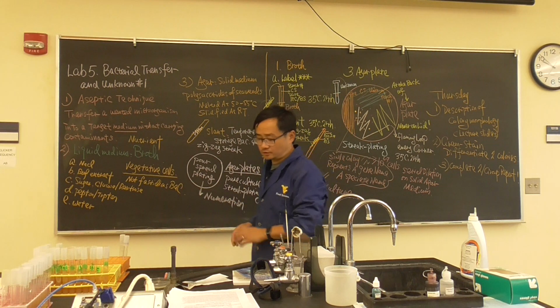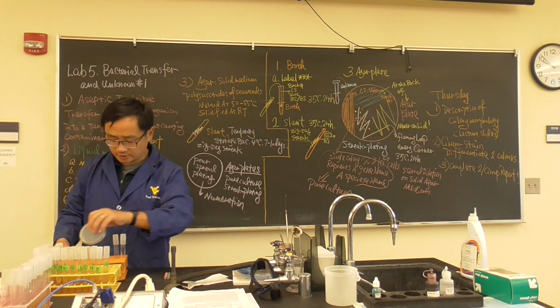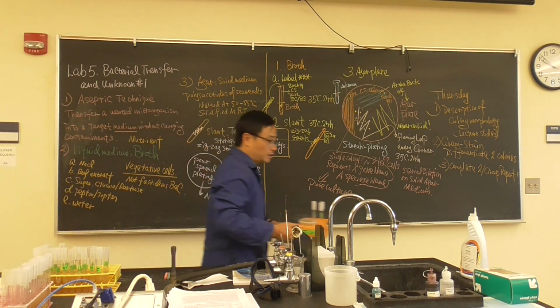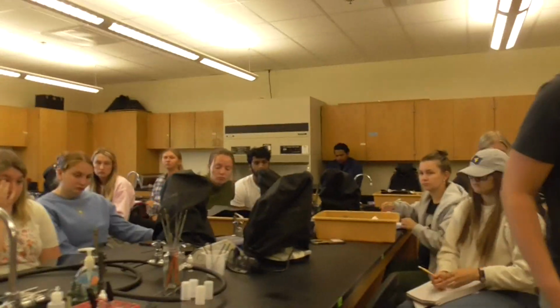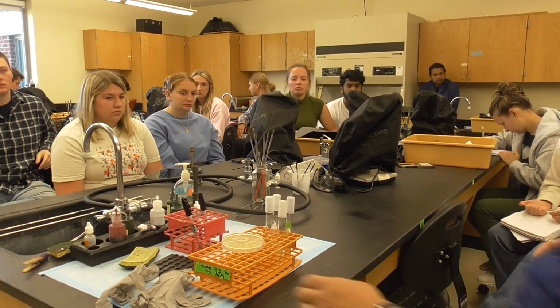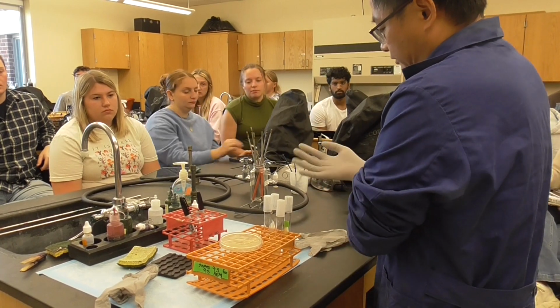Okay, so this is what we have, same as before. We'll be showing you how to do this. So I will pick plates, slants, agar, and the mixed culture. We're going to move to here, the same thing. We'll be showing you how to do it. This is the first time we're using real agar media. So I hope everybody will get it. It is very important. Okay? This is the first time you touch real bacterial media. Although we did a couple of the staining techniques already. So we want to emphasize something.